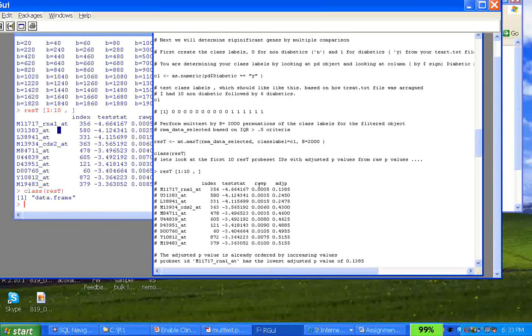If the fold change itself is giving you a good link, then rely on fold change. And if the adjusted p-value is diverting you from a gold mine and misleading you just because we have some fancy way of doing that, take that with a grain of salt. Try all methods: adjusted p-value, raw p-value, simple fold change. Whichever leads you to the most meaningful connection that makes sense biology-wise, that's your truth, not these fancy test statistics or adjustments. But we need to know and understand how to do it, and that's the whole point of this course.